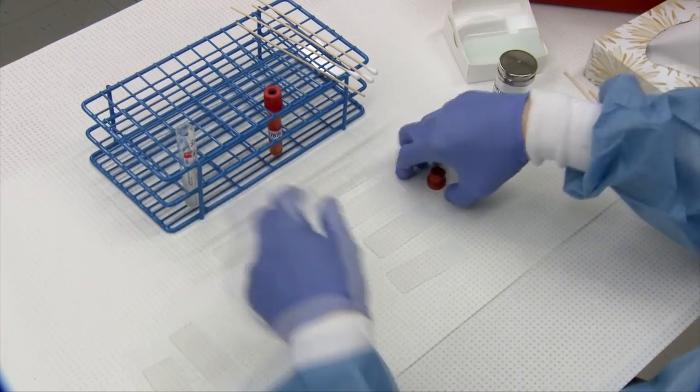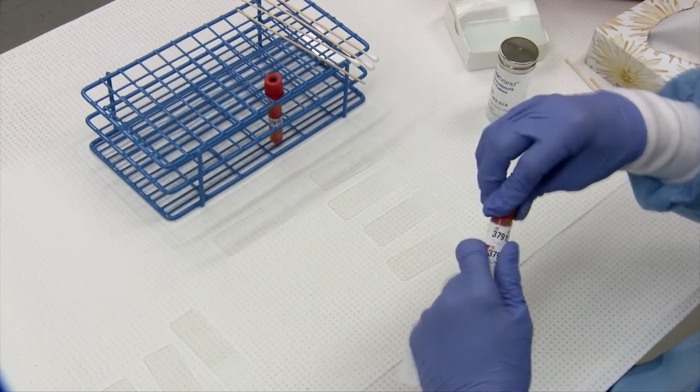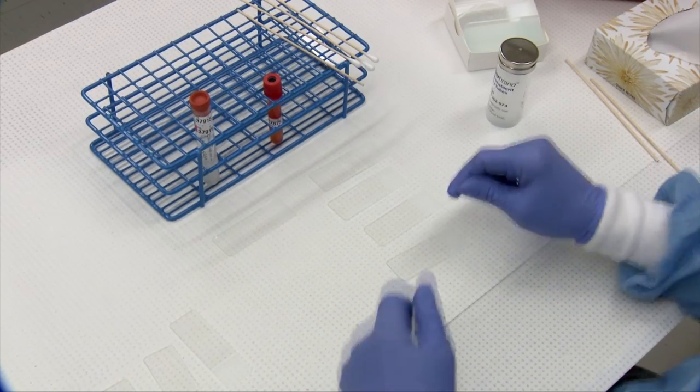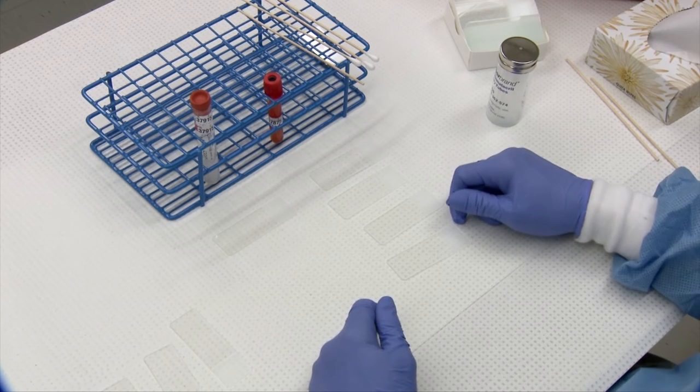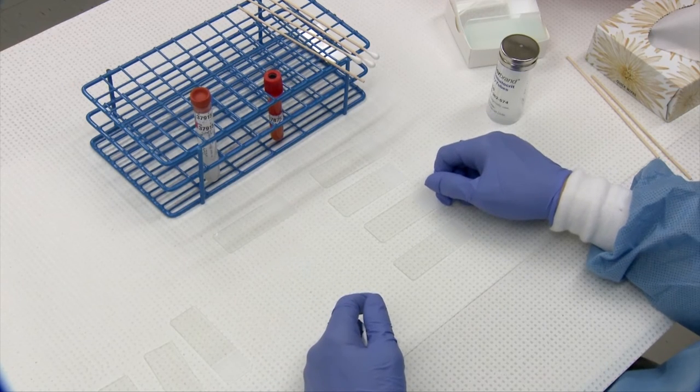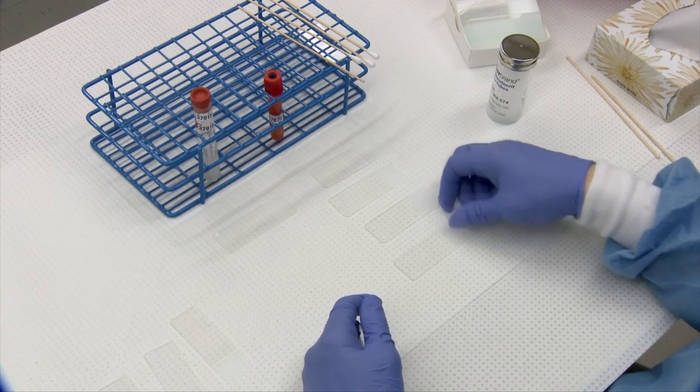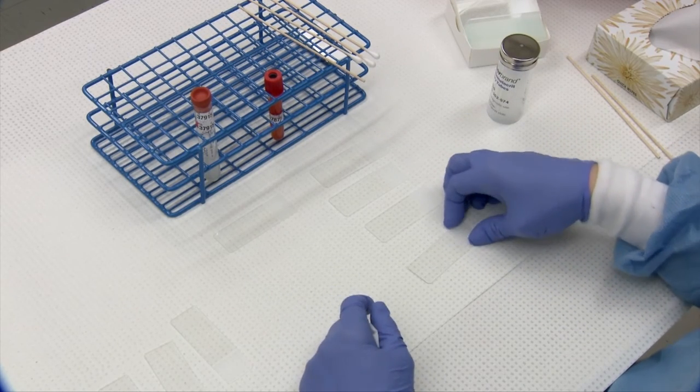The other thing about fluids that is important upon submission is to submit them in EDTA tubes. You can use a red top one for culture but EDTA provides the opportunity for your sample to not clot if there is blood present. As you can see these are not purple top tubes but that is our wish.